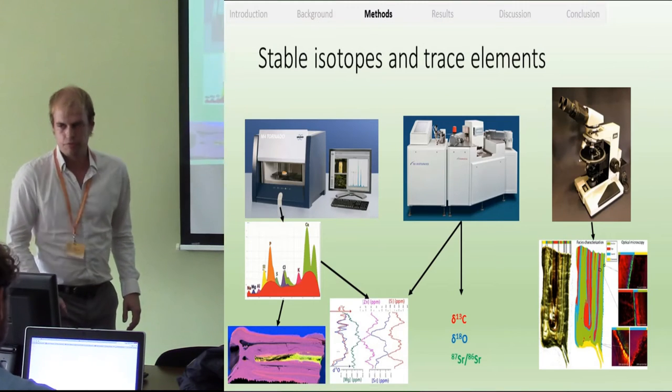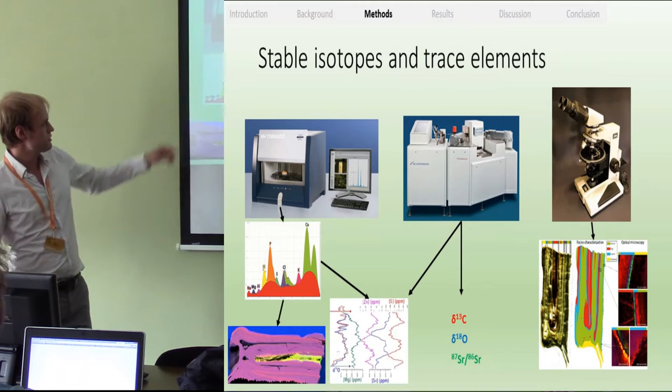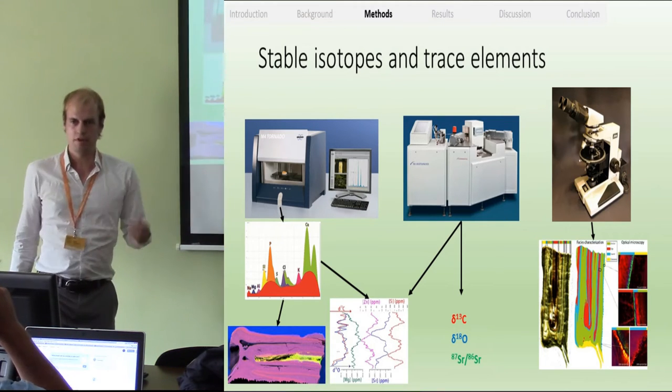So there's a few techniques that we use in Brussels. One of my favorite ones is this one, the µXRF. Some of you might have heard of it.